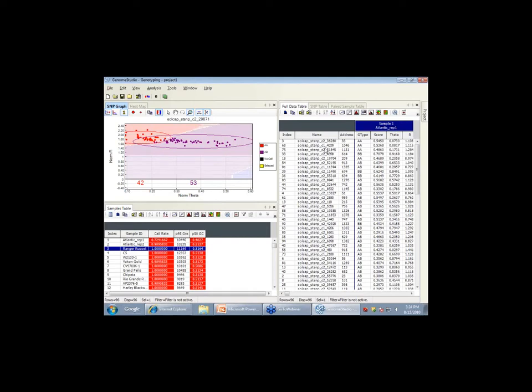Yeah, to be honest, yes, I know where all the SNPs are, but you guys can't know for probably 2 more months. We're just now preparing the annotation file to go with the SNPs on the array, and with that we'll put the sequence they came from, the transcribed sequences, and whether it's from Atlantic, Snowden, or Russell. We'll tell you which scaffold you're on in the double monoploid assembly, what gene it encodes, and exactly where the SNP is in that sequence.